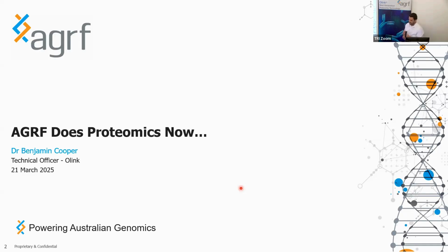One of these technologies being, of course, Olink, which is the topic of this seminar. But in order to understand the strong use case of Olink in the context of broader proteomics, I really want to take a step back and discuss proteomics as a field in general and the types of technologies which are commonly present in proteomics literature and in proteomic studies themselves. So we'll get into it.